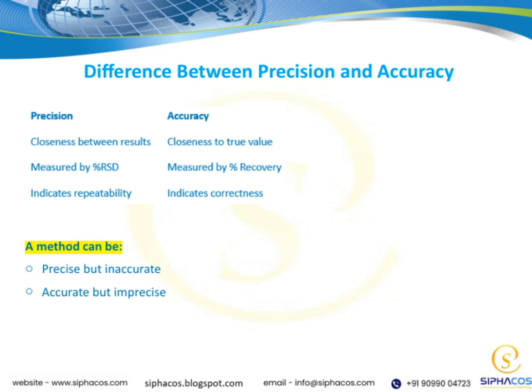This distinction is really important because it highlights that precision and accuracy are related, but not the same thing. Understanding this helps us improve our methods by aiming for both, being precise enough to get consistent results, and accurate enough to reflect the true value. In the context of our overall theme, mastering both precision and accuracy allows us to make reliable, trustworthy conclusions from our data. It's all about balancing these two aspects to ensure our results are not only consistent, but also correct.